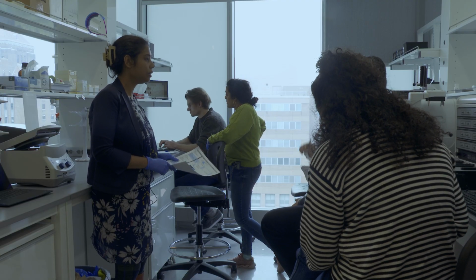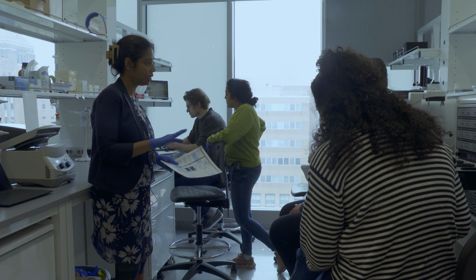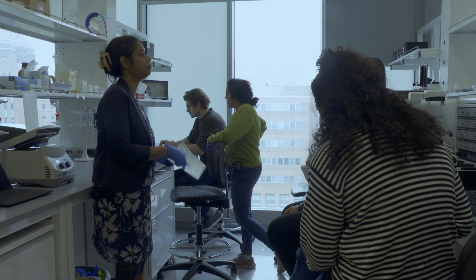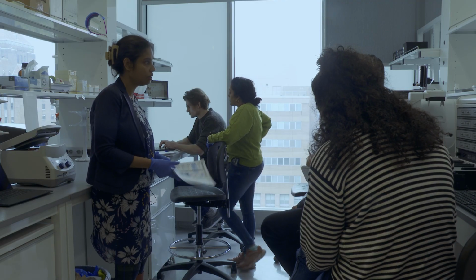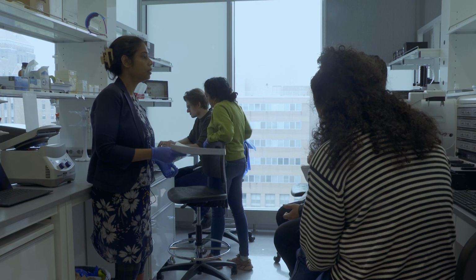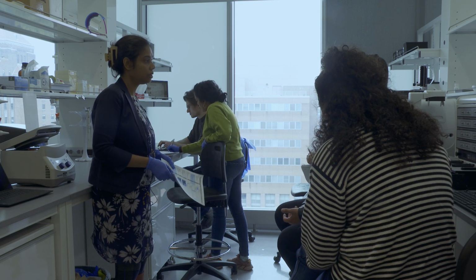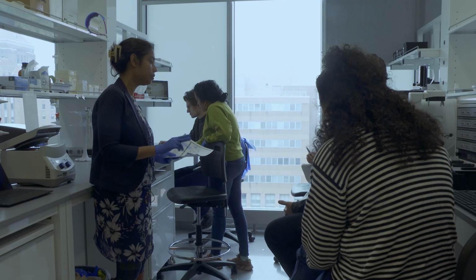But let's say you are dealing with a really low input sample, we also have a protocol for low input samples. Then you are introducing PCR and you will be able to sequence it. The only thing you will miss is the base modification information, because you are introducing PCR. So the methylation information would be gone.